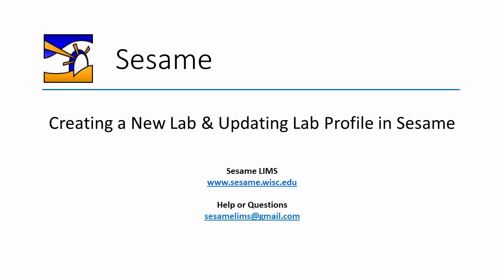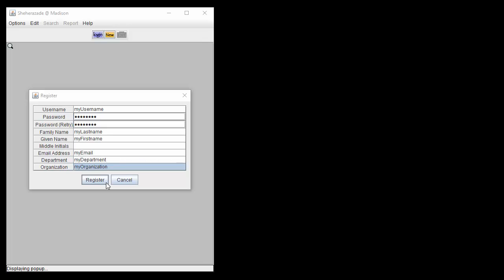Hello, and welcome to this video tutorial about adding a new lab and updating lab profiles in Sesame.